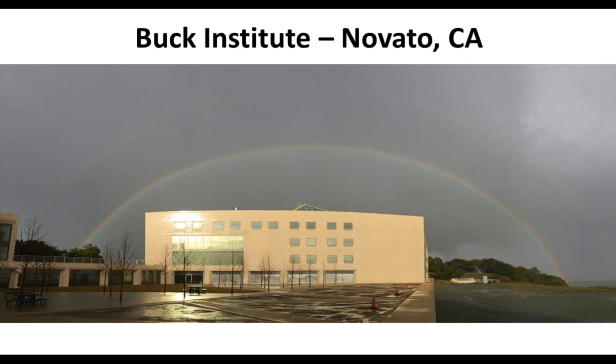For getting the very high numbers of PTMs that I showed in my presentation earlier, definitely DDA will also be a very good way to work, having a workflow of doing the enrichment and then the DDA identification, or maybe then TMT quantification.